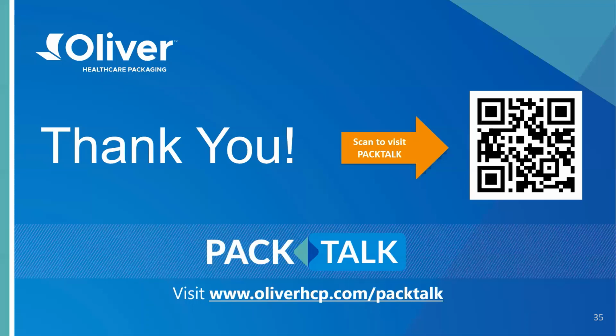First off, we often go through the initial stages and ask a couple of questions: why is there a need for a high-end peel strength value, and what should that value be? Generally the responses are related to concerns around seals becoming too hard to open, or just because I need one. There are various reasons why. So it helps to understand what the goal is when you first start.